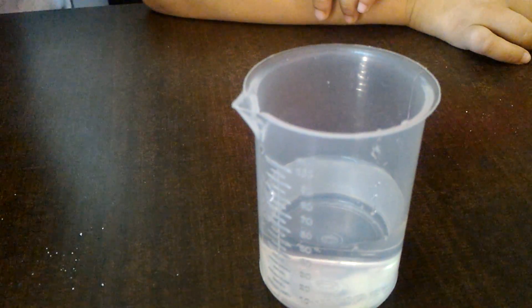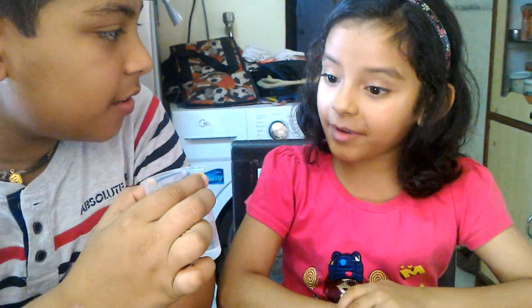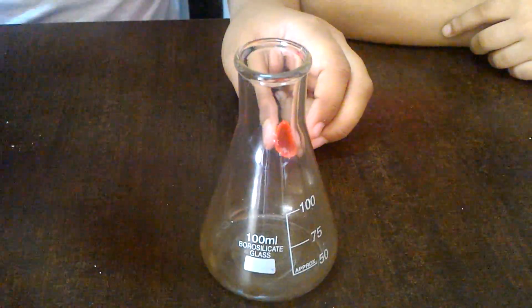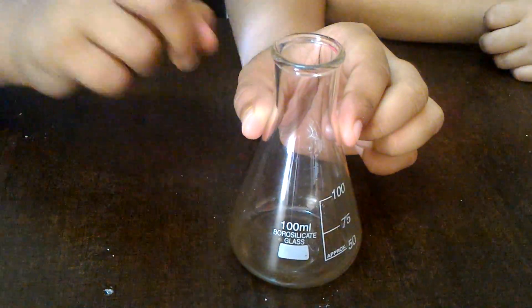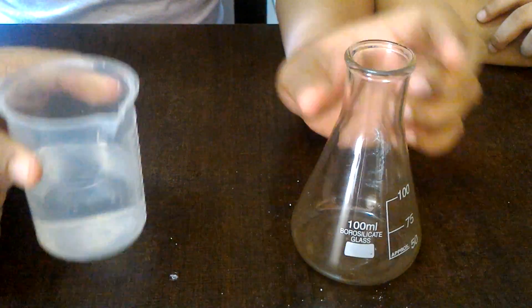We will mix it with a stirrer. Next, we will take our conical flask and put two to three drops of sodium carbonate in it. And into this conical flask, we will pour the solution of water and phenolphthalein.